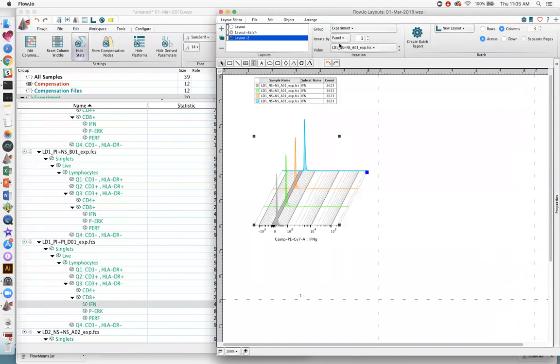Anytime you have 2 or more samples overlaid with one another, you're going to want to change the iteration options to panel, at least panel. Panel or keyword panel is the easiest. When you do that, you'll see that your graph gets blown up, but don't worry.